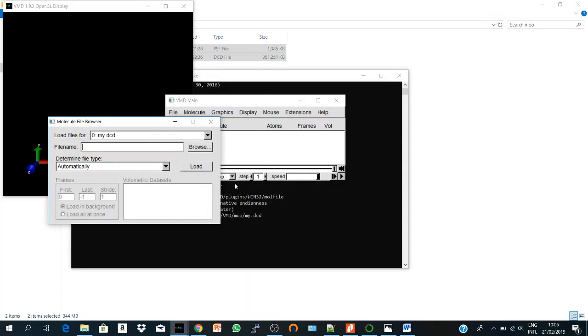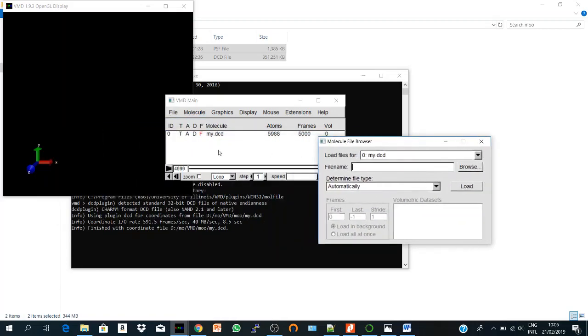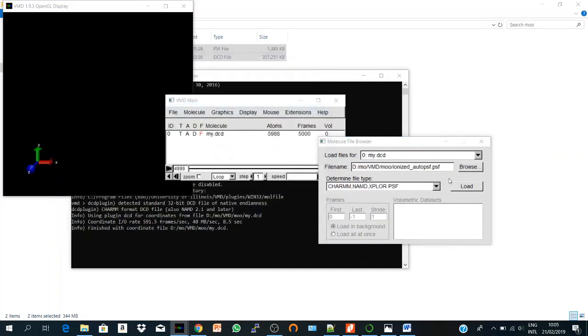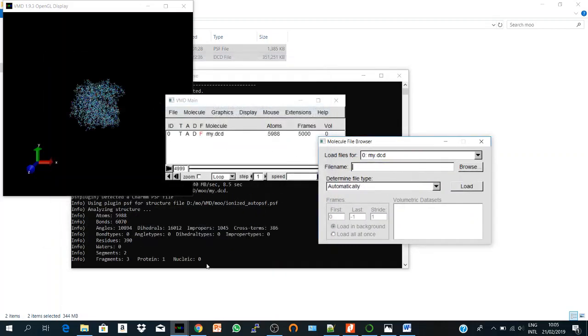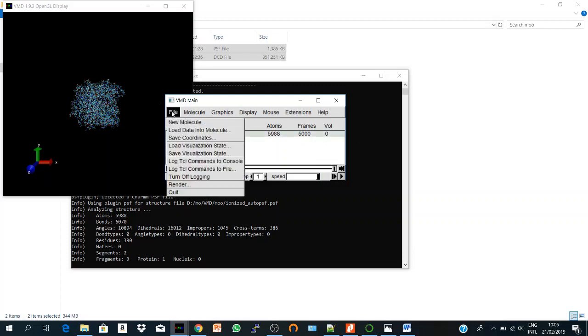So I have here 5,000 frames, I want to create a shorter trajectory from this, so I have to get first my PSF file of the system and here we are.